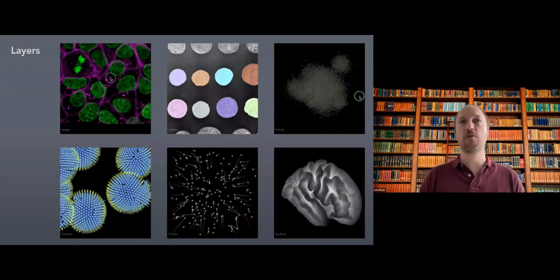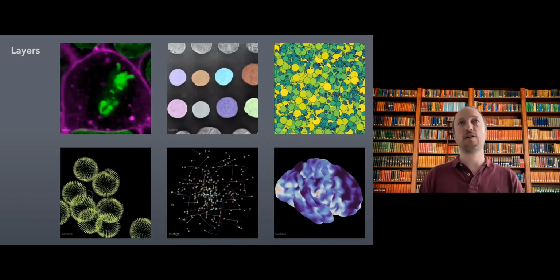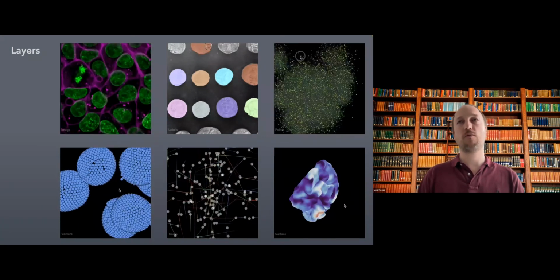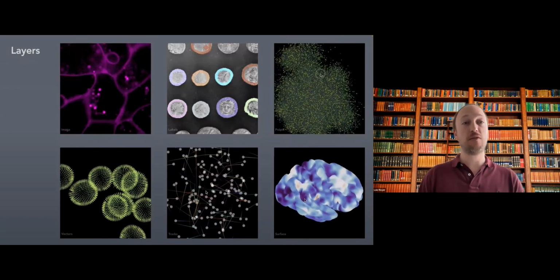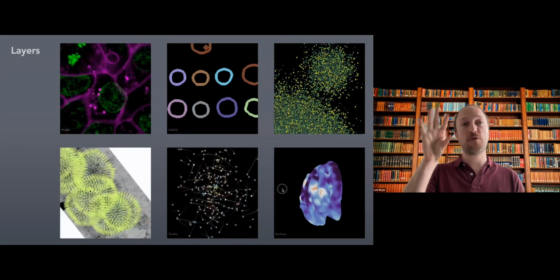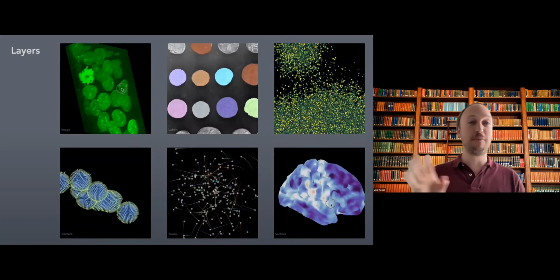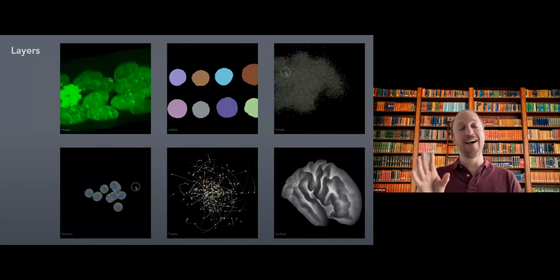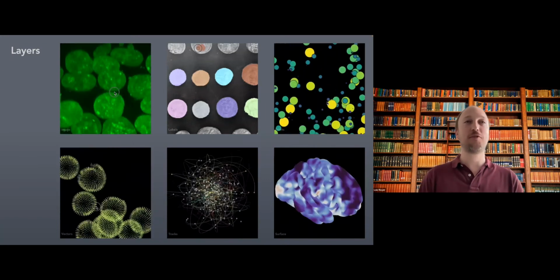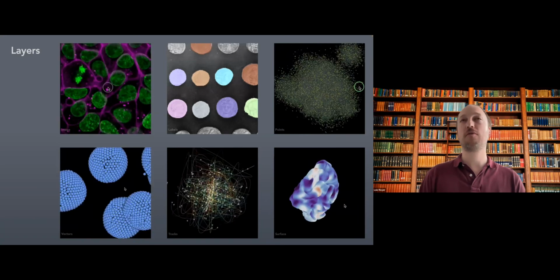I don't know if, okay, the video is playing. So here is a showcase of all the kinds of layers that you can have in Napari. Here I would also like to say that most of these slides I'm showing right now are made by Tali Lambert, who has shared these slides with the Napari community, and I cannot make them better. So I'm literally using them as he has designed them, because they're just amazing. So thanks Tali for sharing these slides with the community.